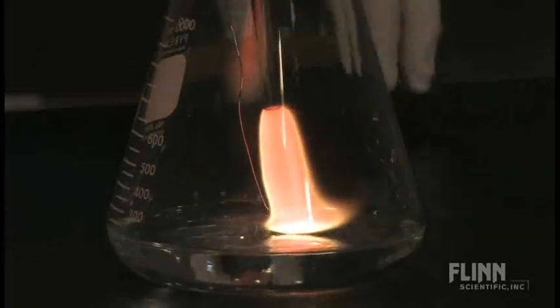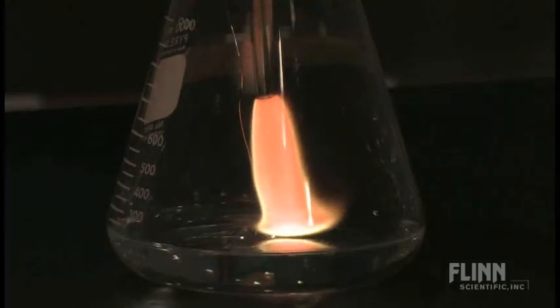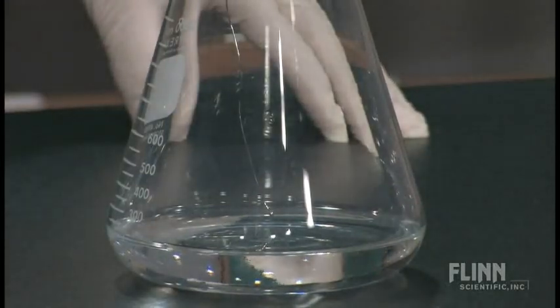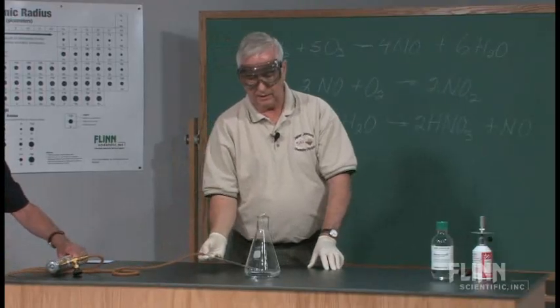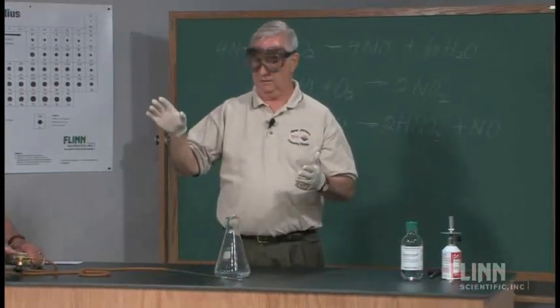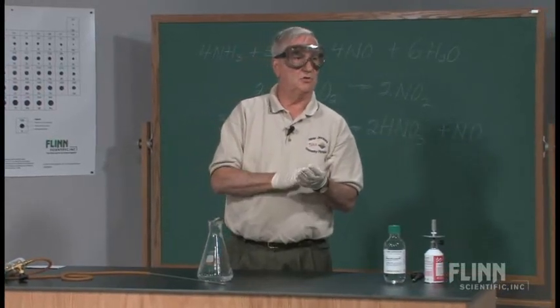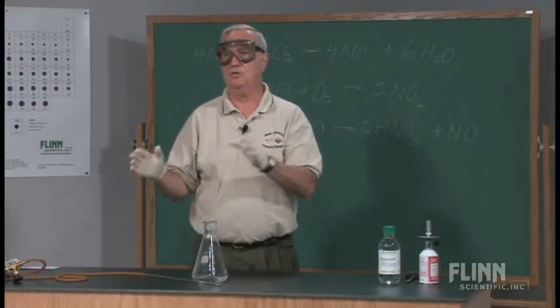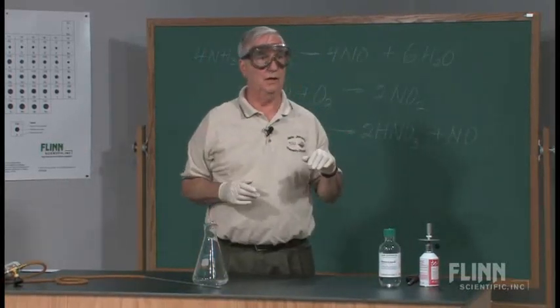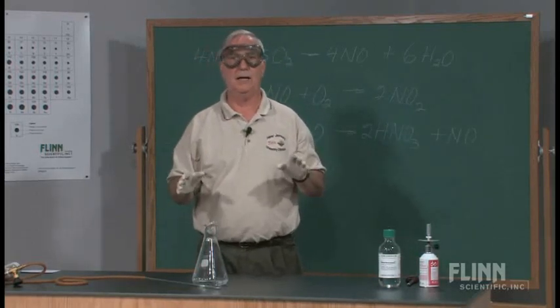Greatly increasing the production of the nitrogen oxide, and this is what would be done in the industrial process. Now, a demonstration like this is a demonstration of catalysis. It's a demonstration of equilibrium because I have just shifted the equilibrium by radically increasing the concentration of oxygen, causing that reaction to proceed at a much greater rate.